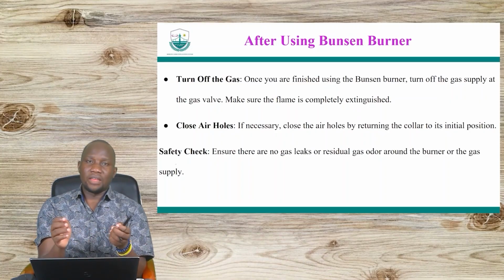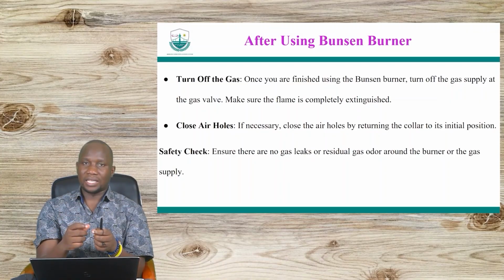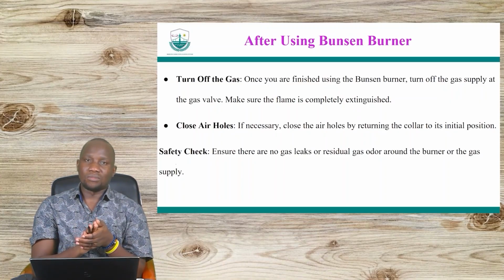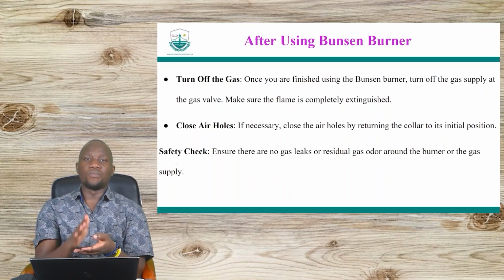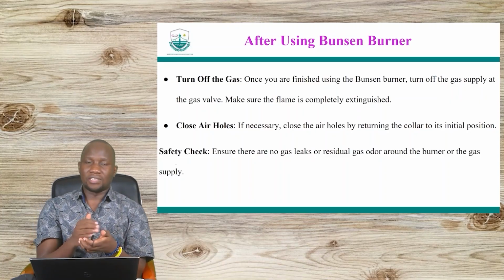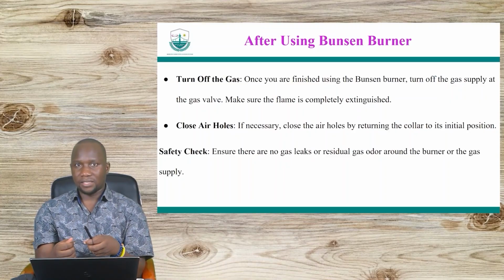Connect it first, make sure that the air holes are closed using the collar, and then after that adjust the collar. If there is any kind of gas leakage, please report it so that you don't have any fires happening. There shouldn't be any gas leakages.